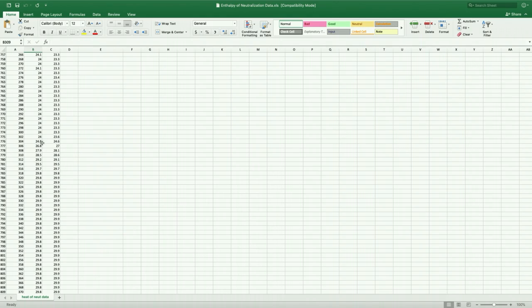So there's what you look for for your initial temperatures. The final ones look like 29.9. I would probably put that for both, so here they both got 29.9. And now you have the temperatures that you need for your solutions to be able to start doing the calculations for looking at how much energy that reaction released.